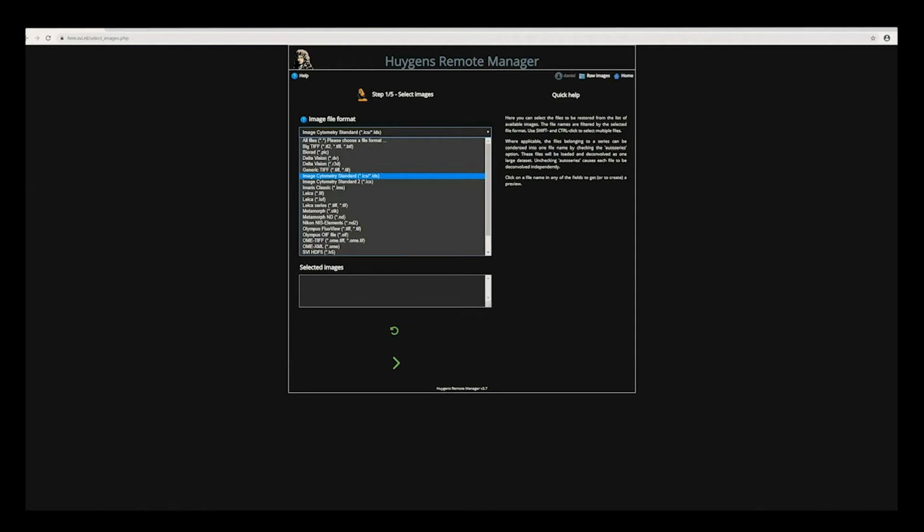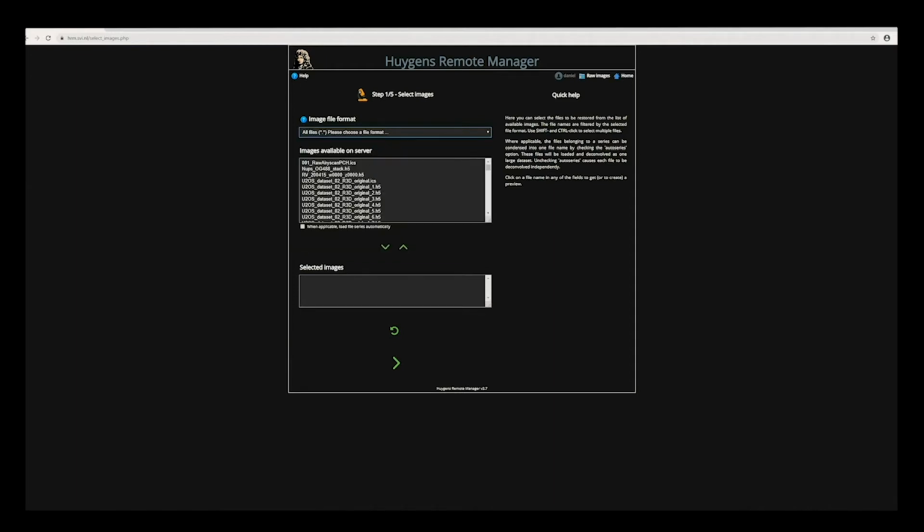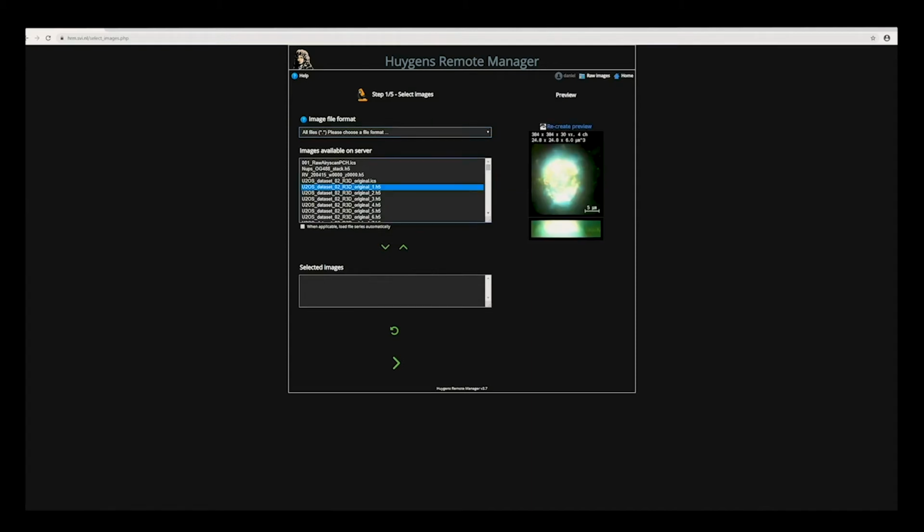If you still find it useful to filter a specific format, that's okay, you can use it. But for the ease of usage, we thought that enabling people to mix different file formats into a single batch could potentially be helpful. To illustrate that, I have 100 wide-field images here, all recorded with the same settings and saved as HDF5s.